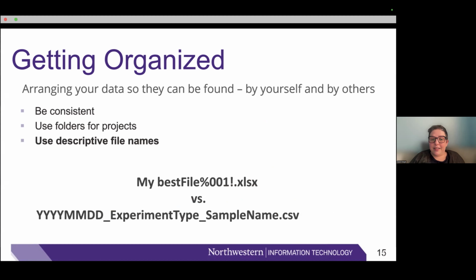File naming is something that has really come to bite me when I didn't think about it. I would just use the default file name when I was saving a file. It would be file 1, file 2, file 3. Then I would have to open up each file and look at the rows and columns to try to figure out what the heck was in that file.